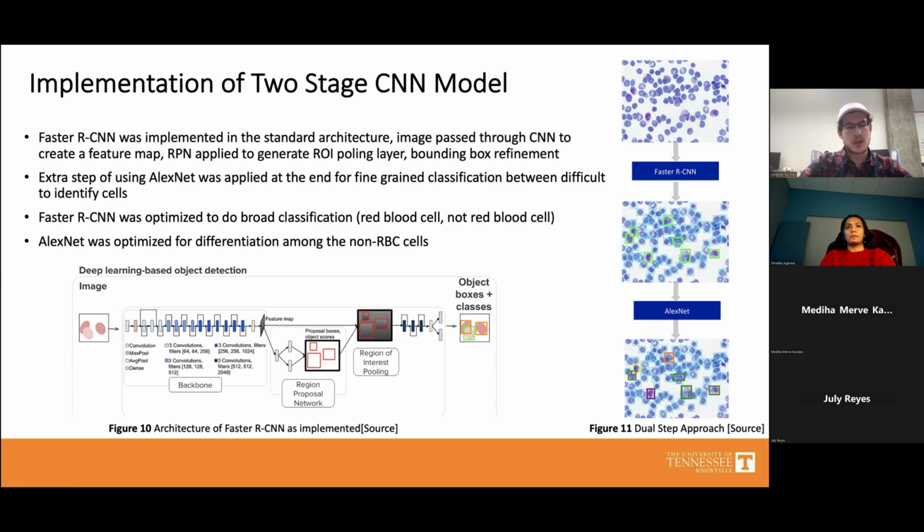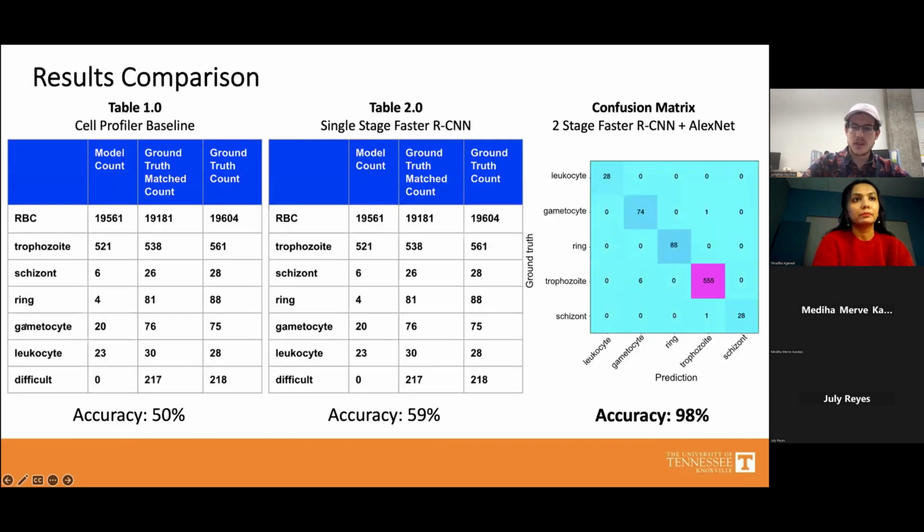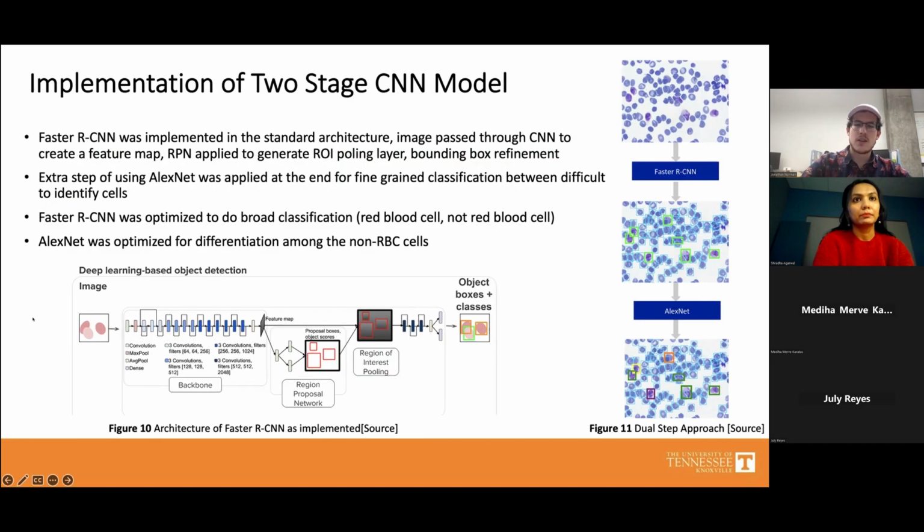They did benchmarking on both the single-stage and the dual-stage versus the standard benchmark. On the bottom here, I won't go too deep into this, but it's talking about the different levels of convolution they do in the images, so that's how they're doing different levels of feature extraction. You see the standard faster RCNN architecture here, where following the convolution of the image to extract the feature map, things are passed through the region proposal network, and you finally result in an object classification and region isolation step.